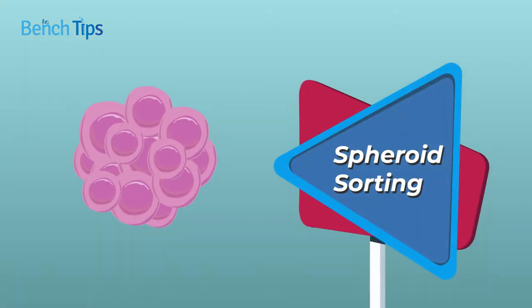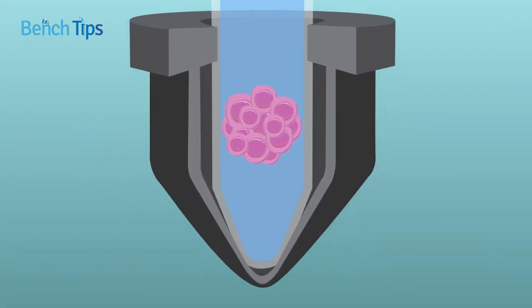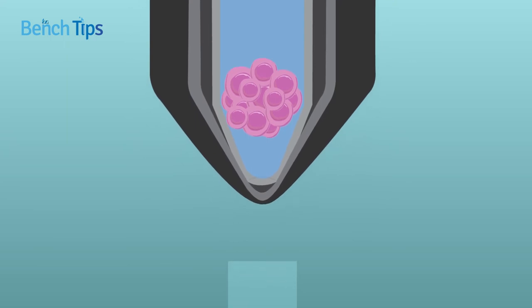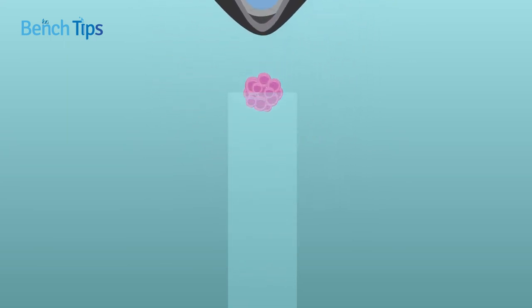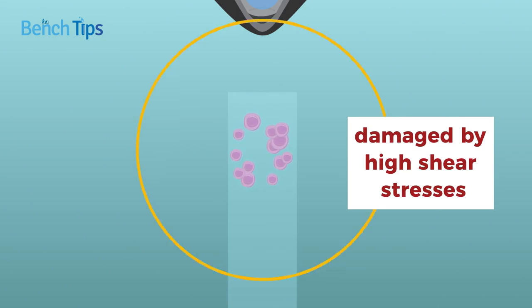Spheroid sorting is also problematic. Not only are spheroids frequently too large to pass through the nozzle, but when they do make it into the cell sorter, they are easily damaged by the higher shear stresses required to isolate them.